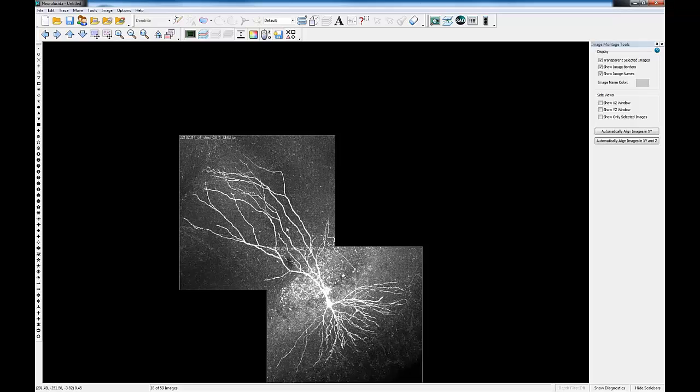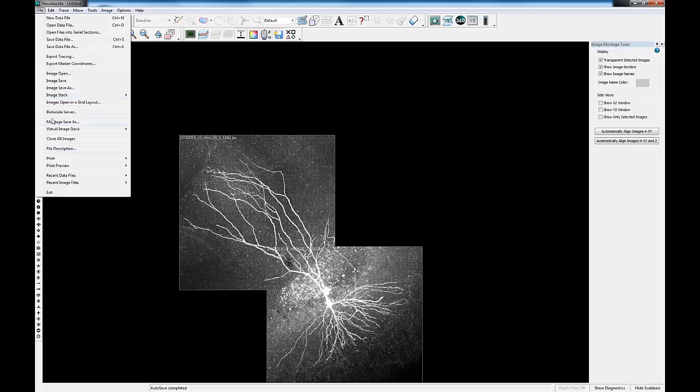But when you're right in the thick of things, this apical dendrite or even the basolateral dendrites, there's a lot of material here for fiducials, so a lesser degree of overlap is perfectly acceptable. So the next step would then be to write out that image file.